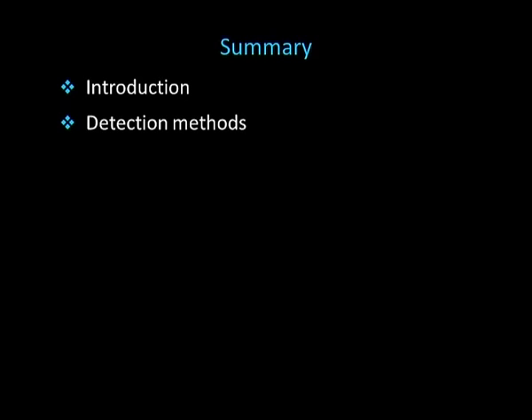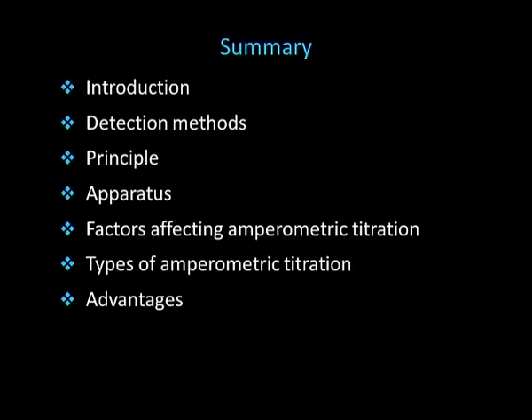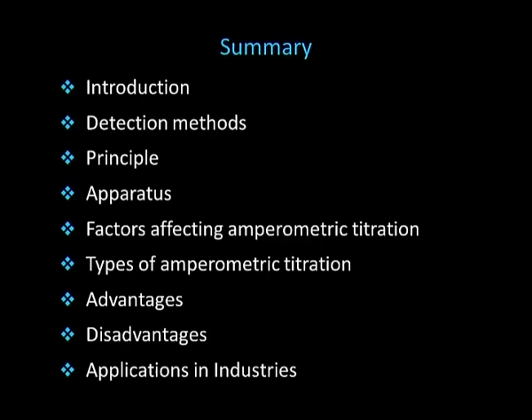To summarize, we have discussed amperometry, the detection methods, the principle of the technique, the apparatus which is used, factors which affect amperometric titrations, types of amperometric titration, and advantages and disadvantages of amperometric titrations. Applications in various industries have also been explored.